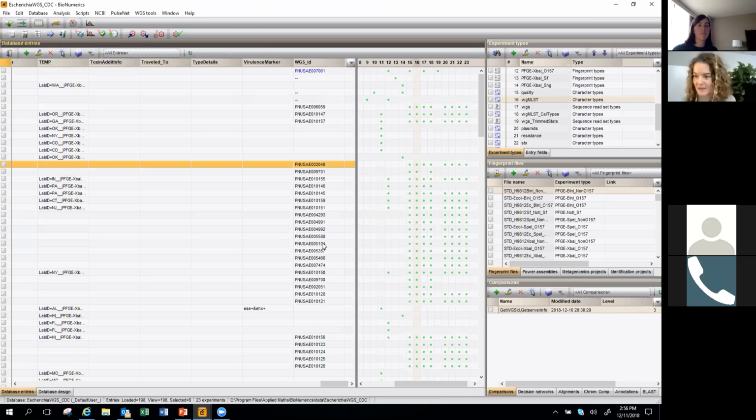All right, so the next question is, what is the scalability of this method? And I think this is referring to the nomenclature scheme that you showed. As in the current example, you showed only 5 samples. What number of samples can be analyzed efficiently?